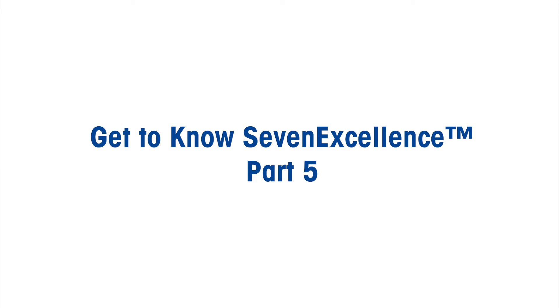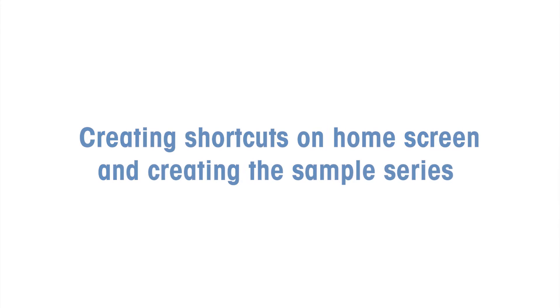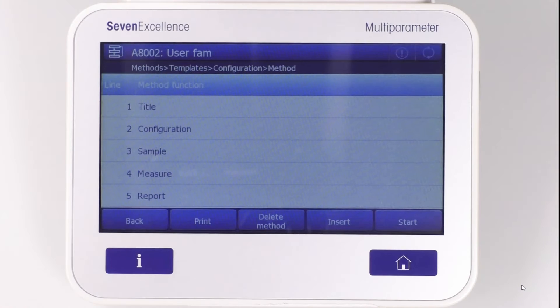Welcome to the video 'Get to Know 7 Excellence, Part 5: Creating Shortcuts on Home Screen and Creating Sample Series.' Up to nine shortcuts to methods can be placed on the main screen.